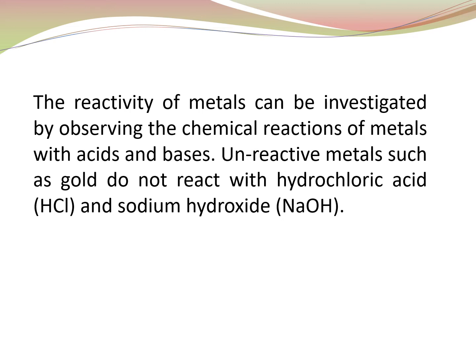So the practical is mainly about the reactivity of the metals with these acids and bases, as we saw in the previous slides. We will investigate and observe the chemical reactions that these metals will have with the acids or the bases. And if a metal does not react, like an unreactive or inert metal, the example is gold. Gold is an unreactive metal because it does not react with hydrochloric acid or sodium hydroxide. So it reacts with neither the acid nor the base.